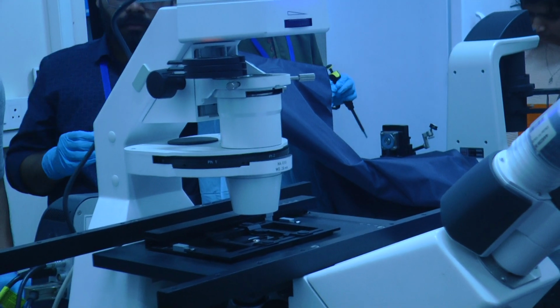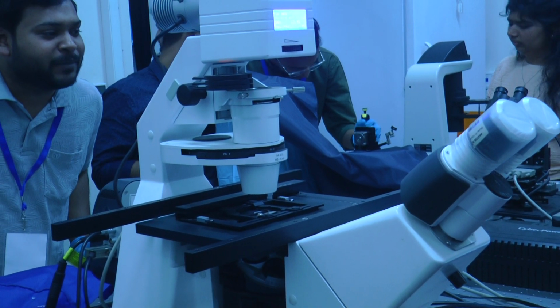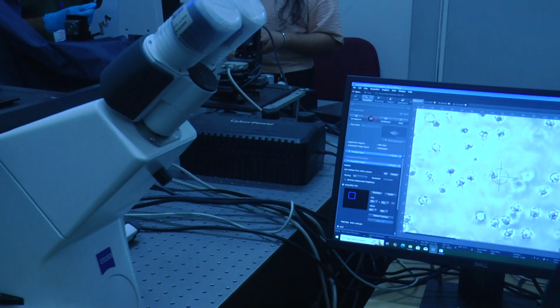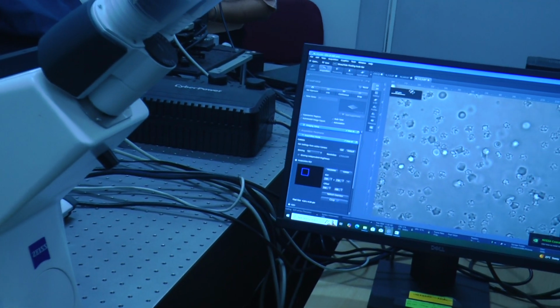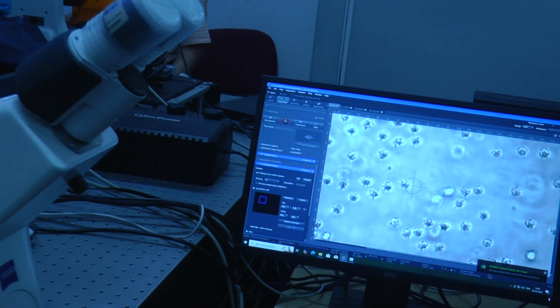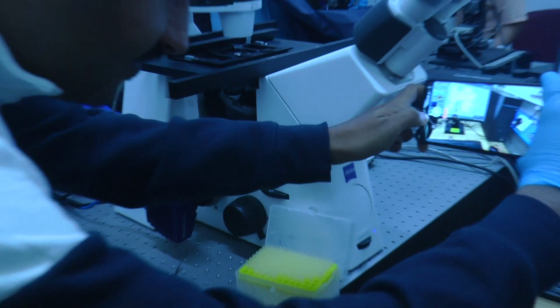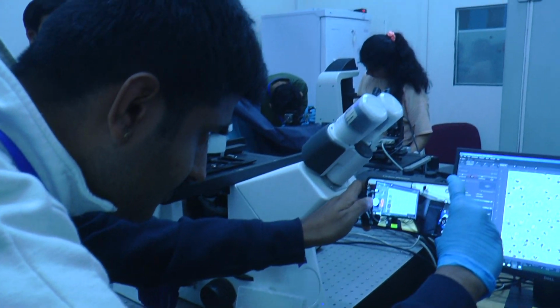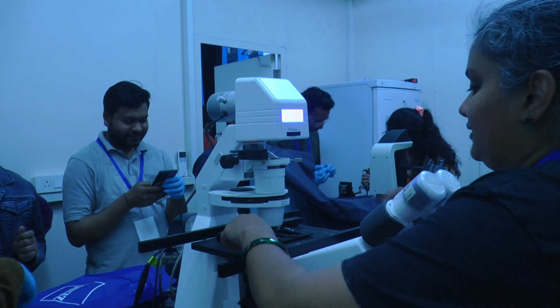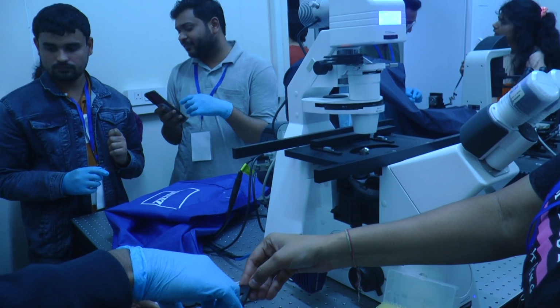No, I think so. 1.2. No, it already fell down. Yeah, very nice crenation. Now you can see the crenation, right? For 1.2, this is the reference and this is what you have got. Take the picture, Manisha. You want it? You got the perfect one. Oh, perfect. Please discard.